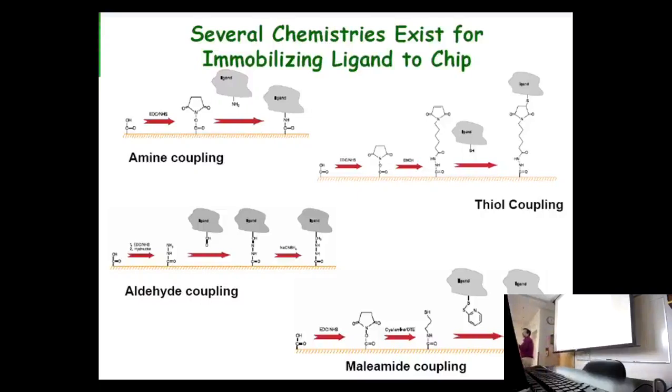A lot of proteins have a lot of amines on them. And the one thing to realize, when we couple them to the chip, they are basically going down sort of randomly, and there's a certain proportion that might bind face down. That's just what we deal with. So you realize that this is a random amine coupling, in how it selects the amines.